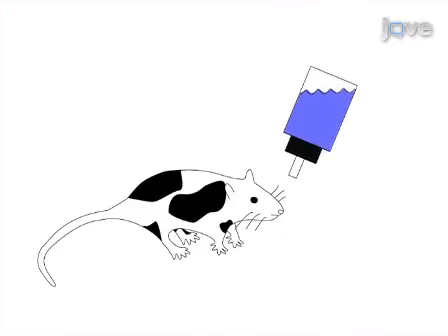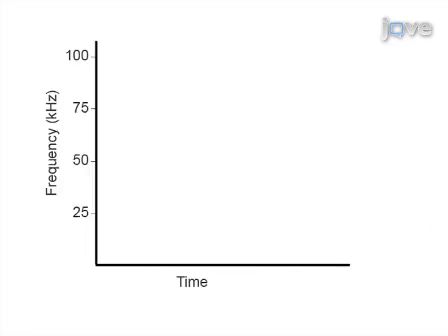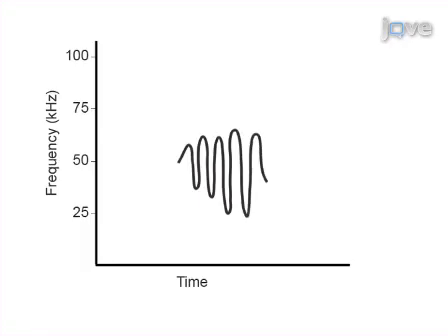The next step is to train for targeted vocalizations through positive reinforcement. After training, post-training vocalizations are recorded. The final step of the procedure is acoustic analysis and comparison of baseline versus post-training vocalizations.